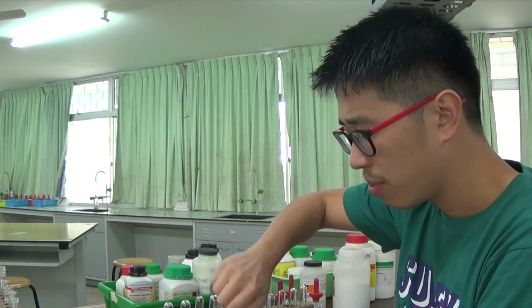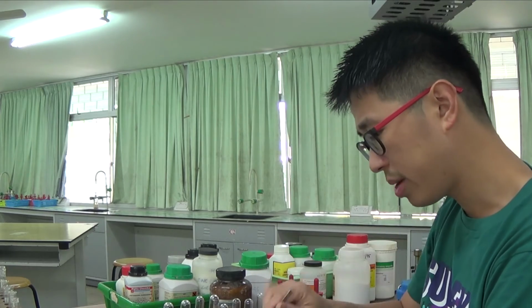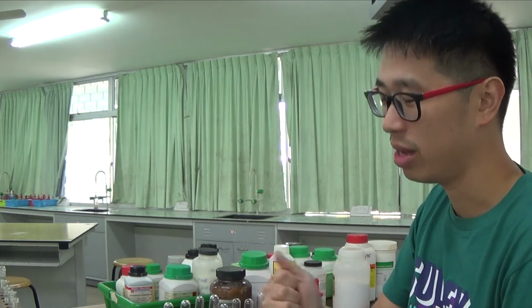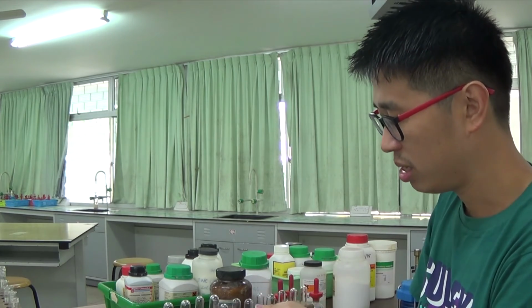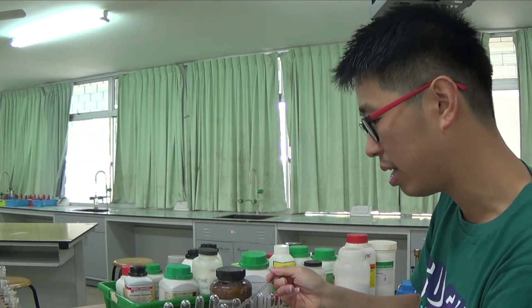Ammonium iron(II) sulfate is not a common thing in A level obviously, but mixtures are common, and the formula of ammonium iron(II) sulfate is a common thing, and of course qualitative analysis is just observation, so they could potentially ask you anything they want.